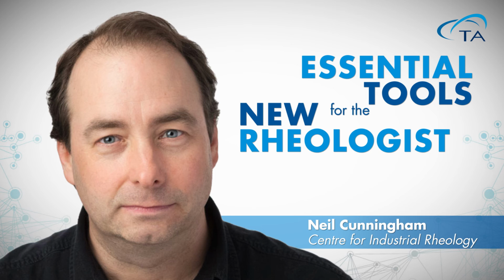Okay, thanks, Dave. Yeah, that's a really good question. Anybody getting into rheology soon learns that there are many different ways of obtaining a yield stress value for a material. I think the first thing to realize is that the term yield stress tends to make you think of it as a single number, a single event that occurs. But in actual fact, as you start to ramp up the stress on a material, the yield process kicks off at some fairly low stresses and then can extend through a whole range of stresses. So it's more accurate to talk about the range of stresses over which yielding occurs, rather than a single yield stress.